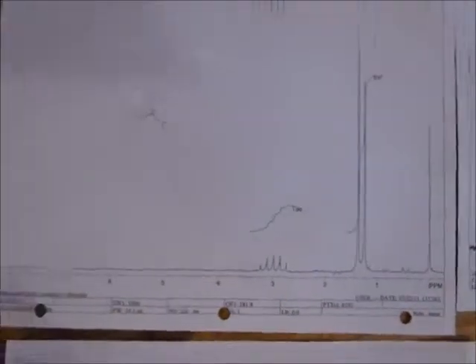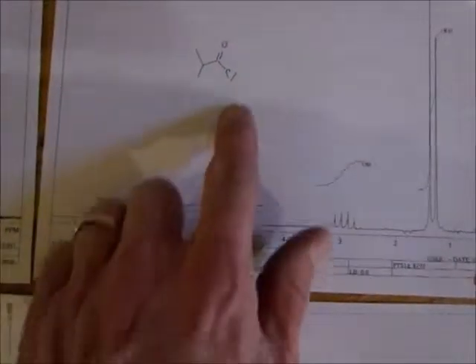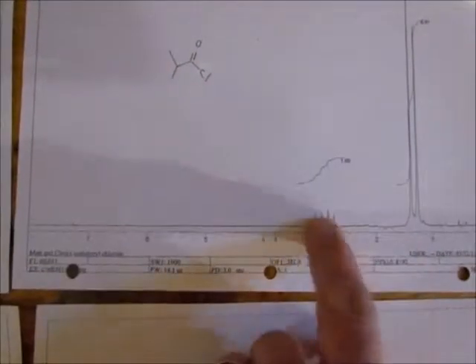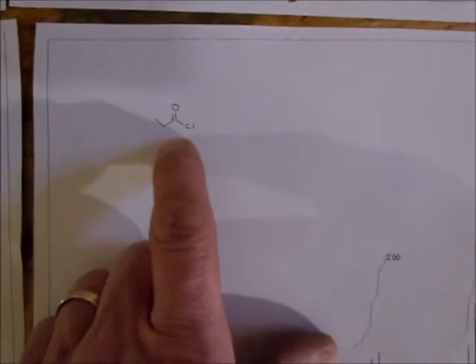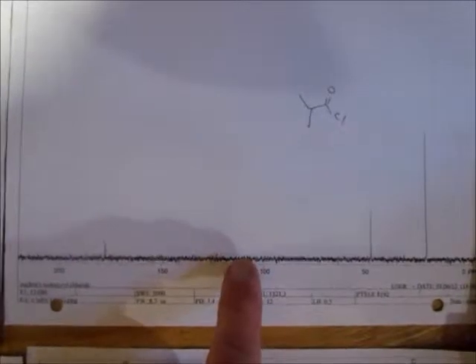Then we go on to, that was a starting material. Now we make the acid chloride. So the old days we had something like this. There's no more hydrogen on the acid. That's gone because it's an acid chloride. So all you're going to have is a doublet and a septet for the old one. The new one, no more acid present because you've made the acid chloride. So you're going to see still a quartet and a triplet, CH2 group, CH3.